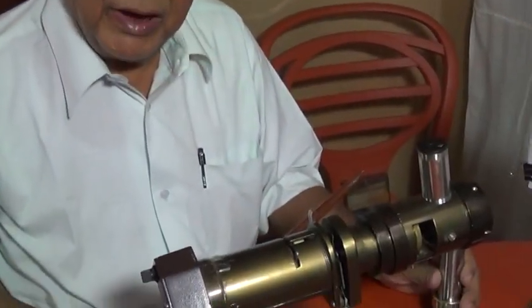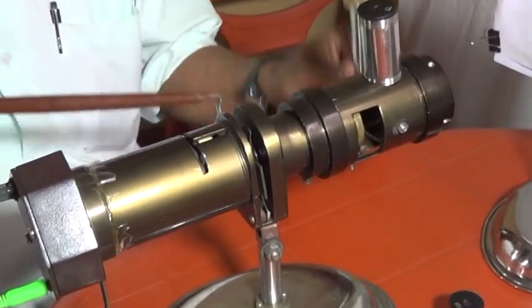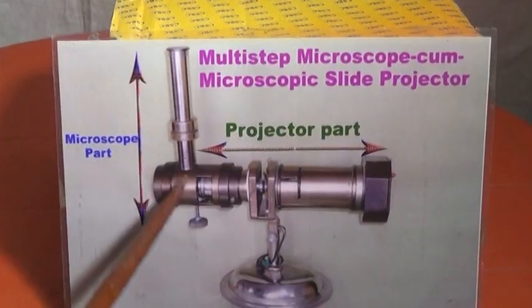It has main two parts: Projector part and Microscope part.